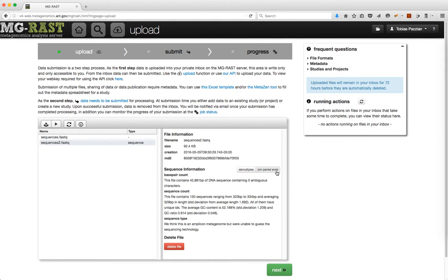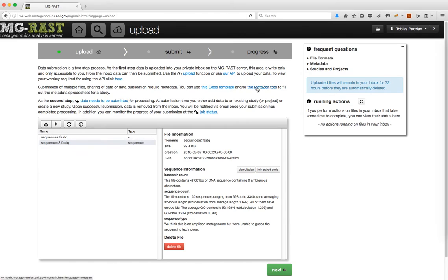To assist analysis and to provide vital information about your data for the community, you should provide metadata. To learn more about how to generate a metadata spreadsheet, please refer to the metadata tutorial or visit the metadata page available via this link.